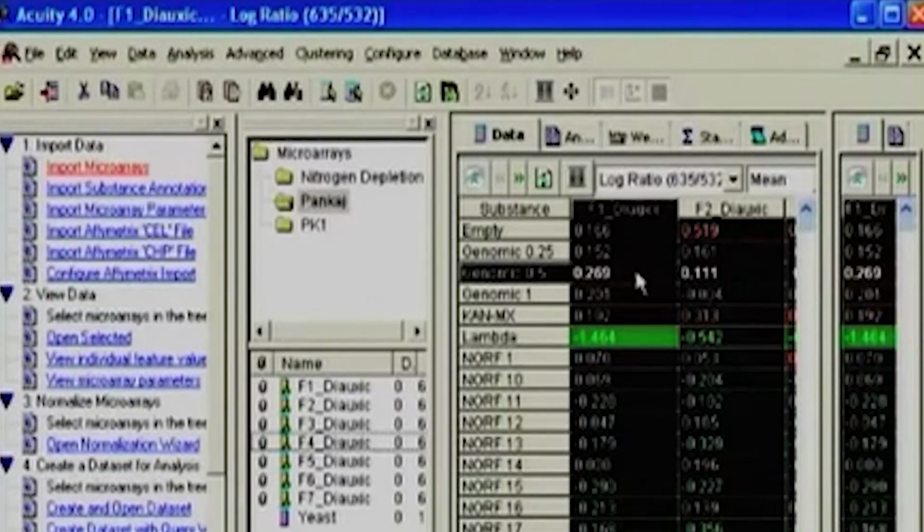The meaning is, when I am looking at the data, you expect that when the green and red channels are both giving the same color, the same intensities, it becomes blackish in color. If they are upregulated, people put them towards the red color, and if it is downregulated, a minus sign will be given and that will become downregulated.